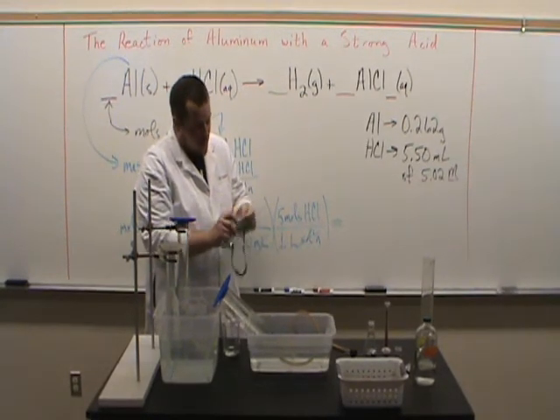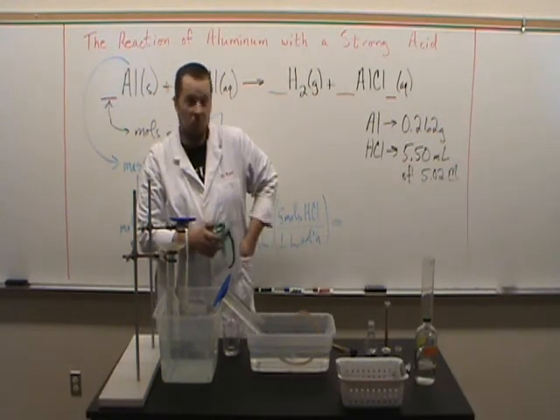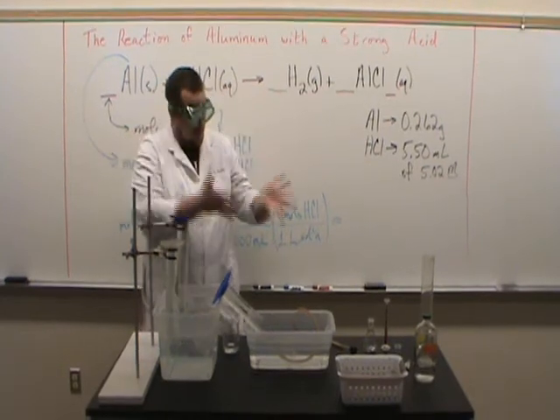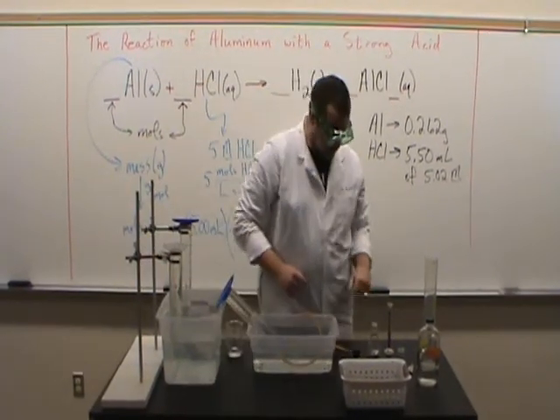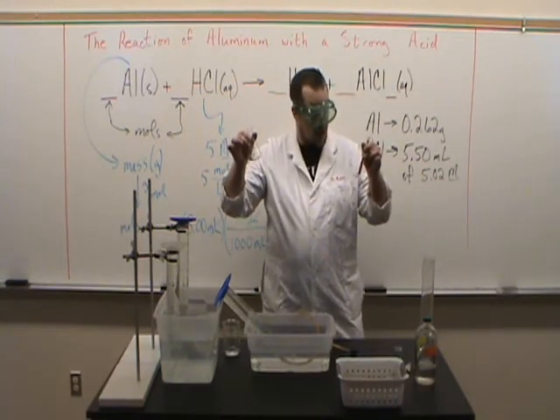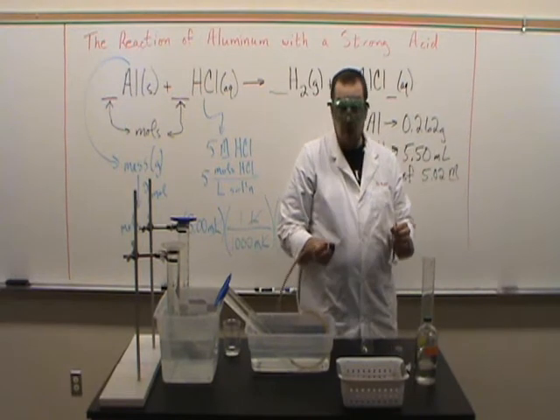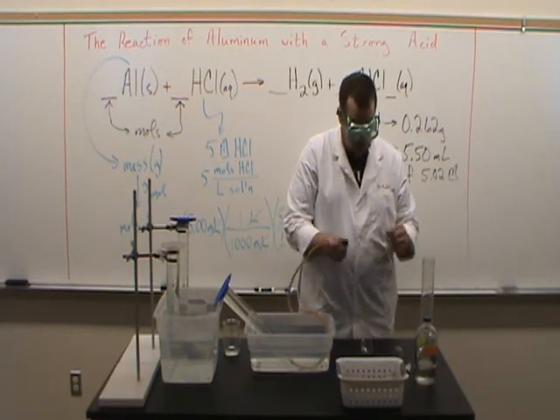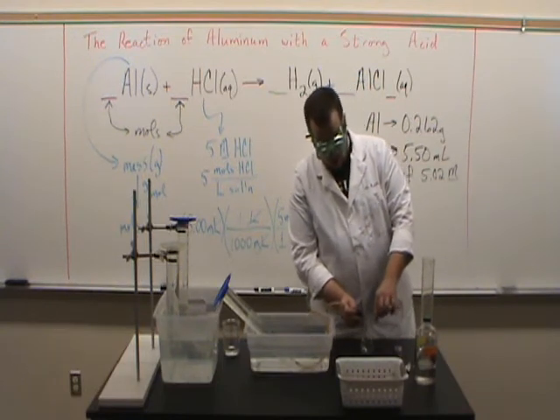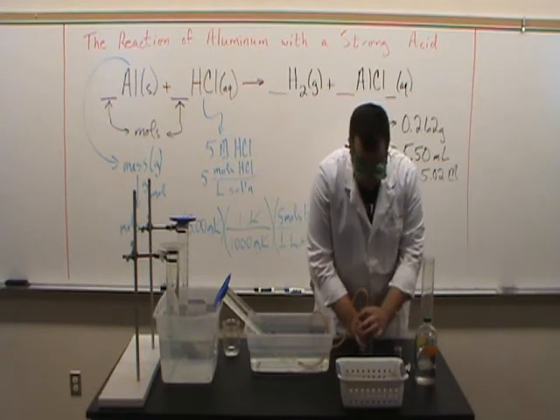You're probably going to be doing this a few times today as well. So if they fog up, stop your experiment, step away for a second, clean them out, and now you're ready to go. Okay. So I've got my aluminum. I've got my hydrochloric acid. With two people, you and your lab partner, this is probably going to be even easier to do without too much delay. So add, and get that stopper in there. Get that stopper in there nice and tight.